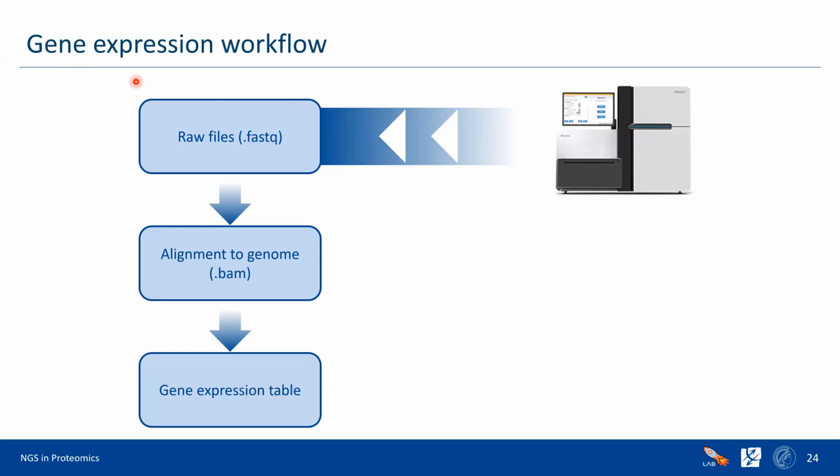So in the NGS world, you have an Illumina machine, from Illumina, not from Thermo, and the machine generates FastQ files. It's actually funny to compare how the NGS world develops compared to the proteomics world. In NGS, you get sequences as output from the machine, but in proteomics you get spectra from machines, which are way more complicated, require interpretation, very robust statistical interpretation, and that's why proteomics is a cool field, because it's complicated.